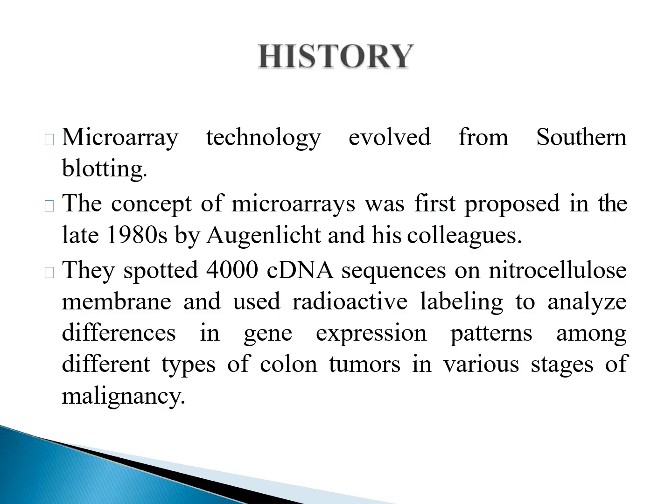History of DNA microarray technology. Microarray technology evolved from Southern blotting. In Southern blotting, we detect the presence of a specific DNA sequence in the sample by using single-stranded chemically synthesized probe molecules which are attached with radioactive material or a fluorescent dye.